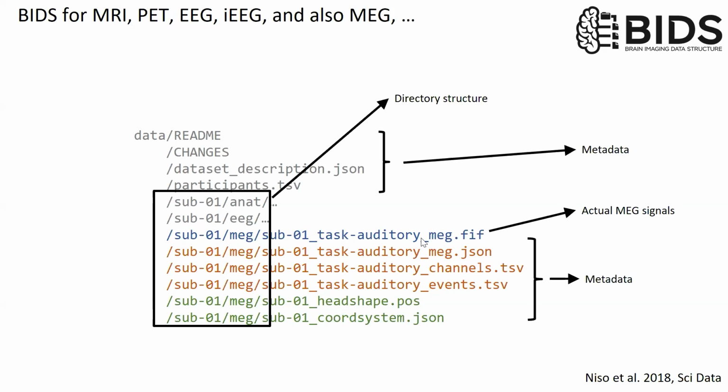And BIDS comes with quite a bit of metadata that describes those parts of the experiment that otherwise would not be known. And I also do hope that MEG vendors, or especially OPM vendors who are still developing the software, are going to adopt BIDS to add all of these missing bits to the recording on disk, because that greatly facilitates the processing and sharing of data.